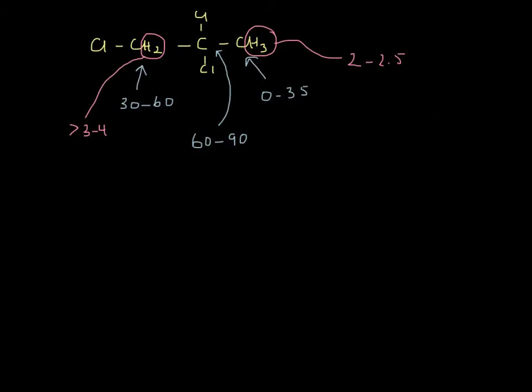So I did mention previously that carbon NMRs wouldn't show splitting because there's not usually a carbon-13 next to a carbon-13. But what is next to these carbons is hydrogens. And of course, hydrogens have small magnetic fields, so those hydrogens actually do have effects on those carbons and do split them up. So normally when we run a carbon NMR, we do what's called proton spin decoupling. And essentially we send that radio wave at the hydrogen's frequency and just cause them to rotate around up and down and side to side. Therefore, they're not going to have any effect on the carbons.